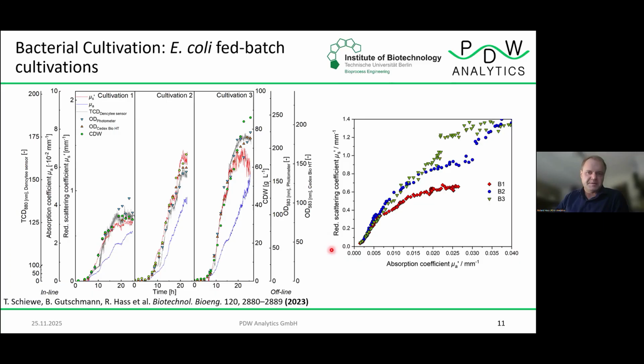We correlated the scattering coefficient with the absorption coefficient. So that's a correlation plot without time, time is gone here. Just using the optical coefficients, it was interesting to see how the performance of the bad batch B1 in the optical coefficients really showed a decline at certain points. So just by using optics, it was obvious that the batch performance will fail.